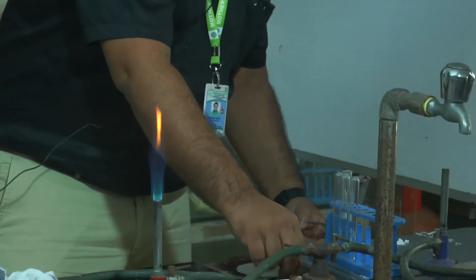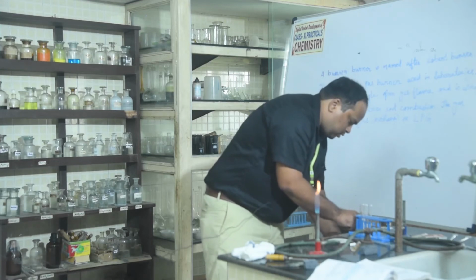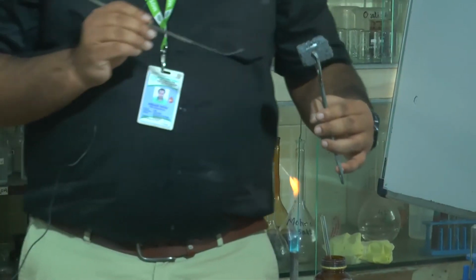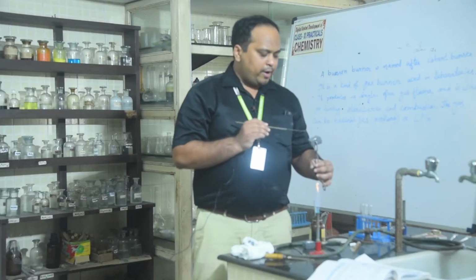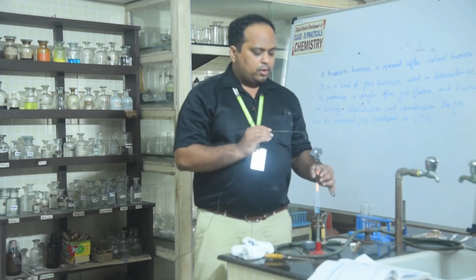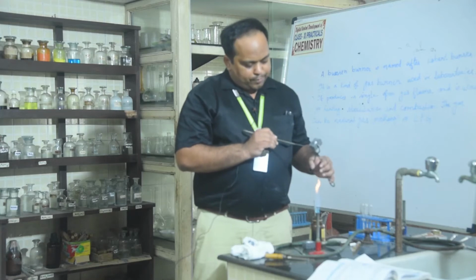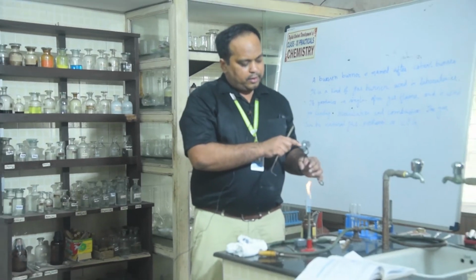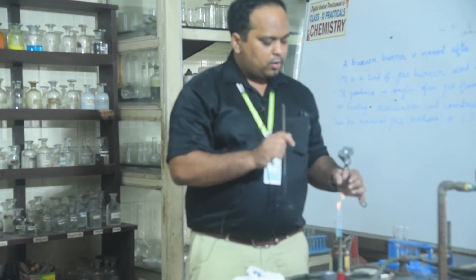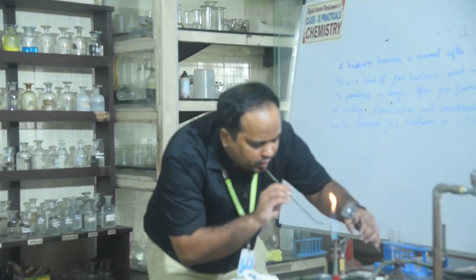We have to see what is happening here. So we are continuing with that. I am just doing the charcoal cavity test, and after it, if anything remains in this charcoal cavity or block, that means you have to perform your cobalt nitrate test. Again I am showing that.